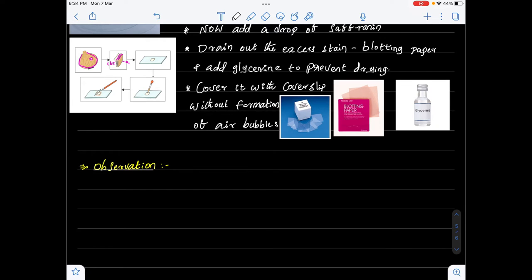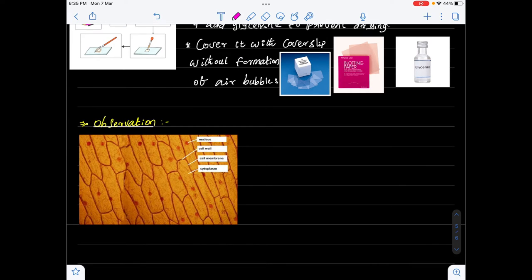Now let me show you how the onion peel cells appear under the compound microscope. In this picture we can see that all onion peel cells are stained properly with saffronin. There is a cell wall dividing all the onion peel cells, and we can see the presence of a peripheral nucleus — the nucleus is positioned at the corner, closer to the cell membrane. Just below the cell wall is the cell membrane, and beneath that is the fluid part, the cytoplasm. These components are visible.